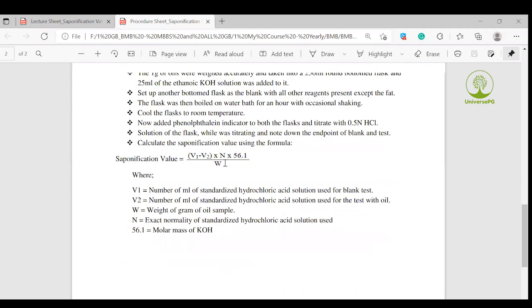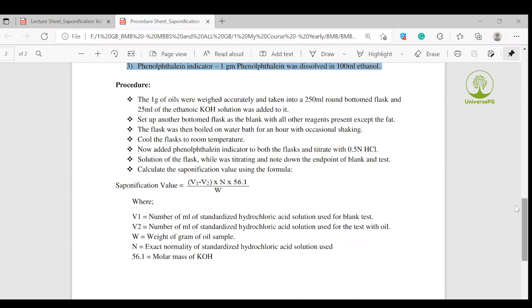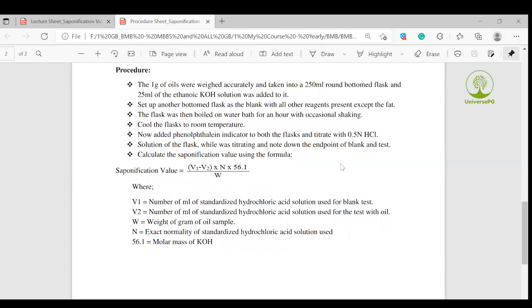Now for the procedure: one gram of oil is accurately weighed and taken into a 250 ml round bottom flask, and 25 ml of ethanolic potassium hydroxide solution is added to it.